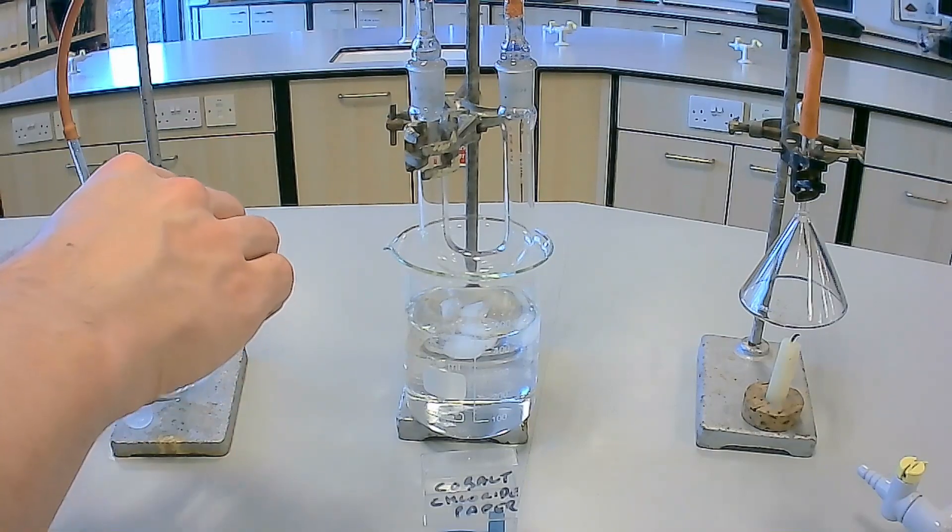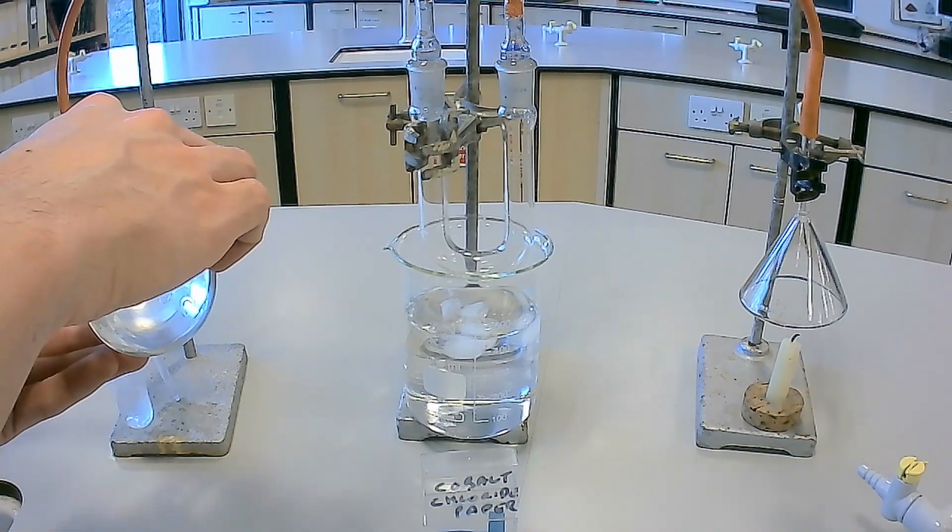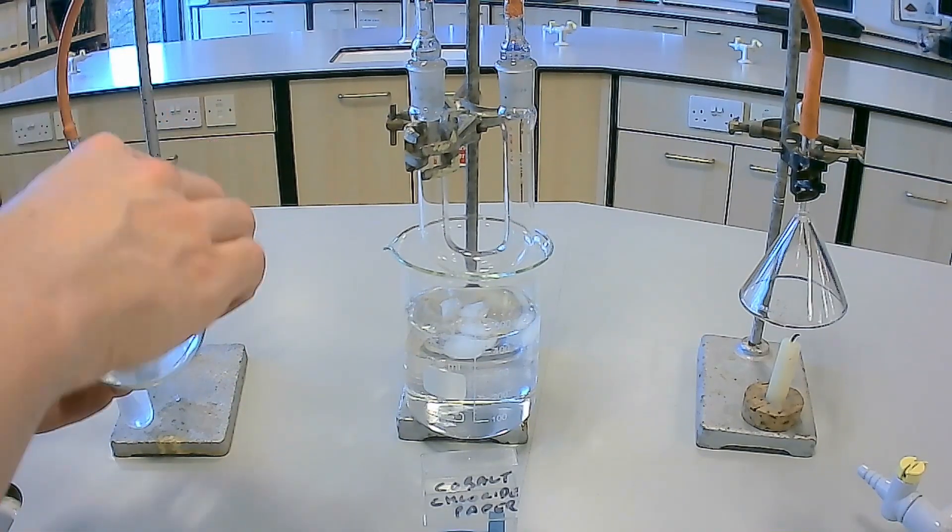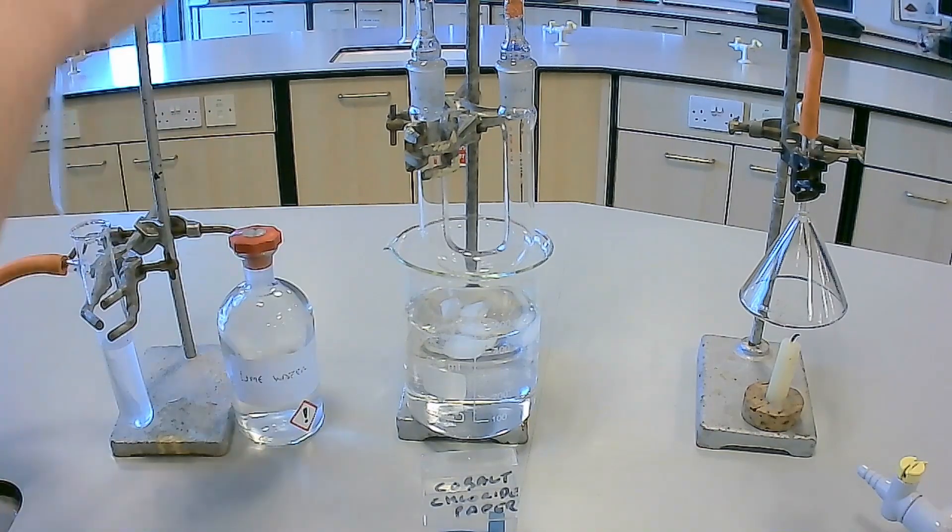First, lime water is added to the tube on the left hand side. Lime water is a calcium hydroxide solution which is used as a test for carbon dioxide gas.